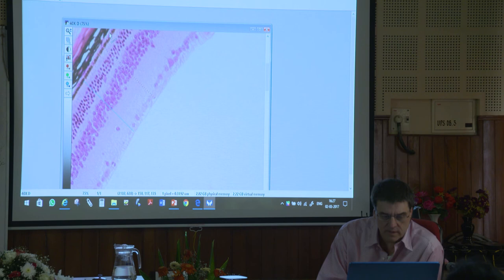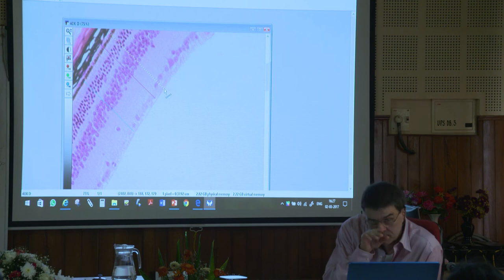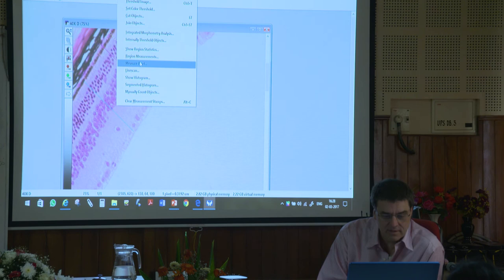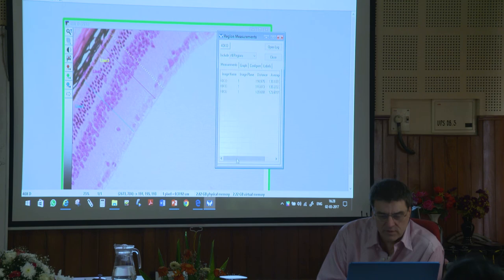And then remember, what do we call the lines in Metamorph? What do we call them? I'm helping you. What do we call them? Regions. We call them regions. Exactly. So if we go to measure regions, remember we talked about this? We could see how many regions we drew. We could get the distance of each of the lines we drew. Then we could open a log. We could plot all that data to Excel, right? That was real simple kind of stuff we could do.